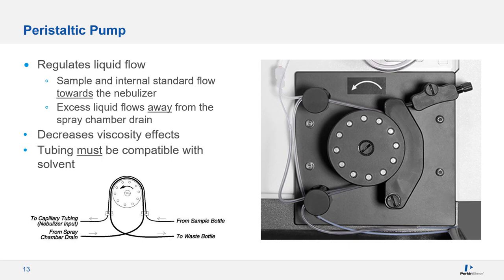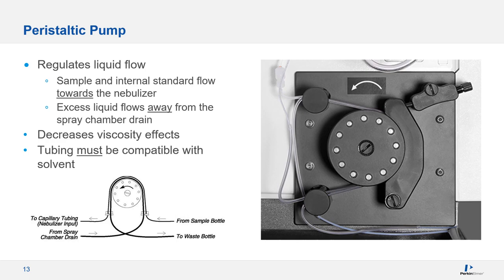Next, you must be sure that your tubing is attached to the pump in the correct orientation. The curved arrow indicates the rotation of the pump head, and the straight arrows indicate the flow path of the liquid. If you hook your drain tubing up in reverse, the spray chamber will fill with liquid and your plasma will go out. Just about everyone has hooked up tubing incorrectly at least once, even among seasoned ICP veterans.